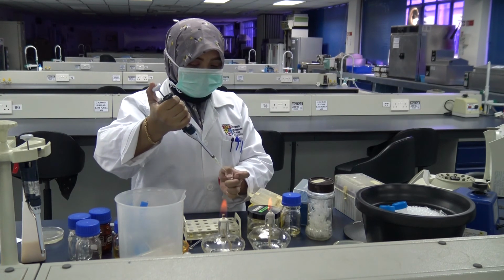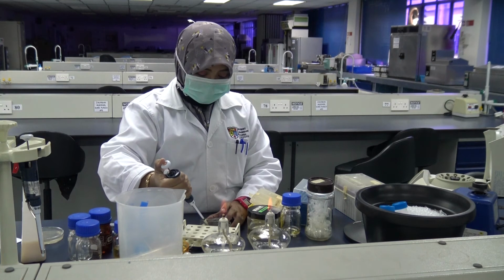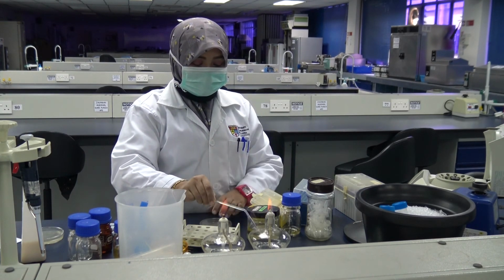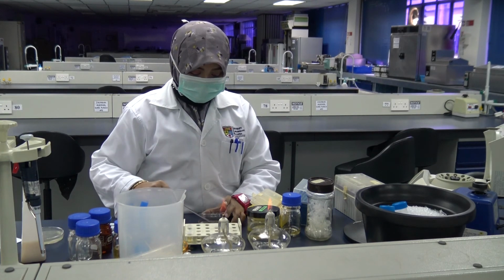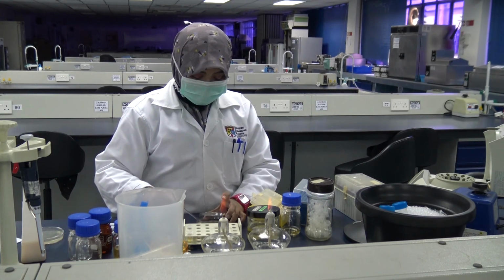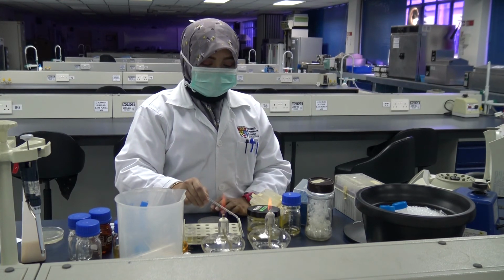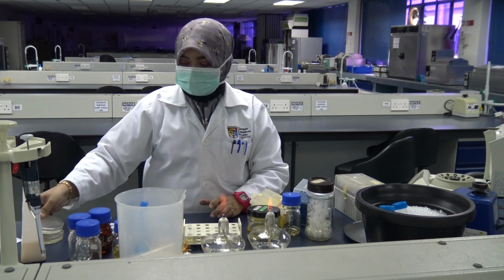This one does not have ampicillin. So for the inoculation of cells from 10 to the minus 4, 10 to the minus 5, and 10 to the minus 6, they are done on nutrient agar. This is to determine the colony forming units per ml in the original suspension. So the colony forming units that you will observe the next day from 10 to the minus 4, 10 to the minus 5, and 10 to the minus 6 will indicate the colony forming units per ml in the original bacterial suspension.